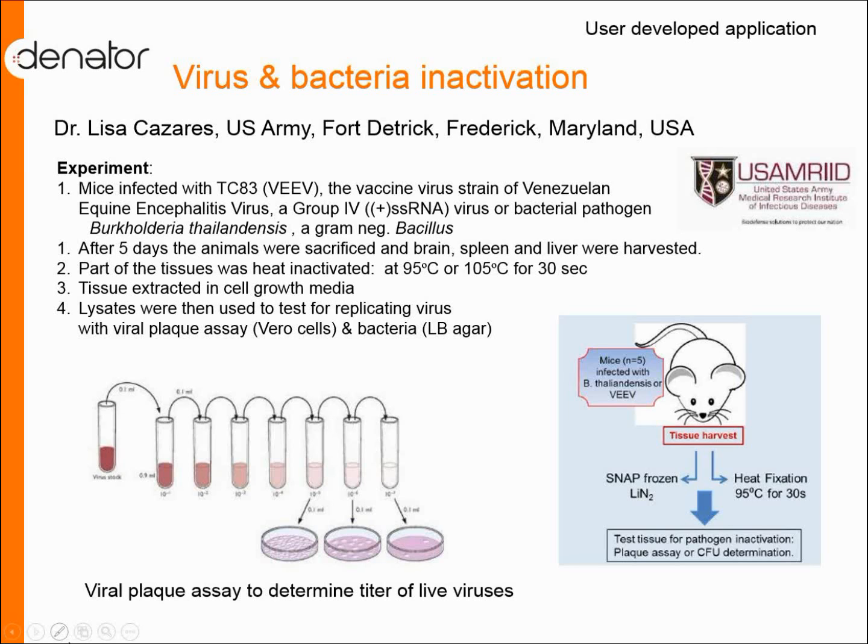And in order to get samples out from those labs, she needed to have them in formalin for roughly 21 days. And by then, the samples were so fixed that it was impossible or near impossible to do the mass imaging analysis that she wanted to do to identify viruses and the distribution of chemicals and pharmaceuticals.